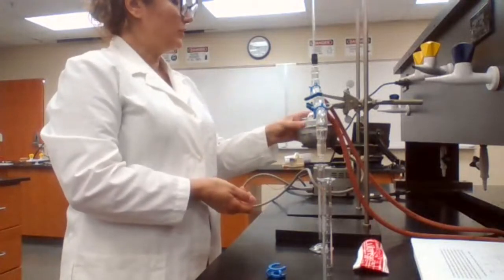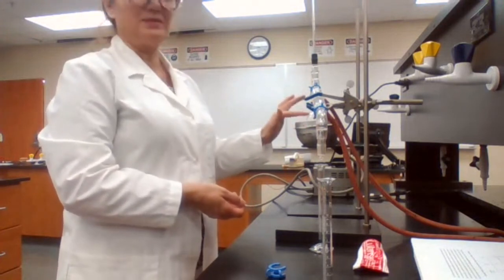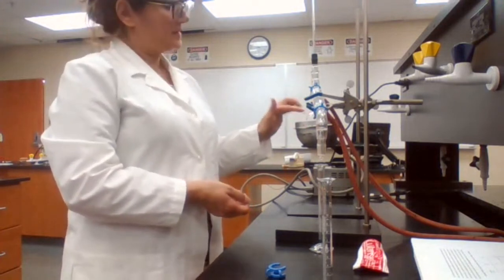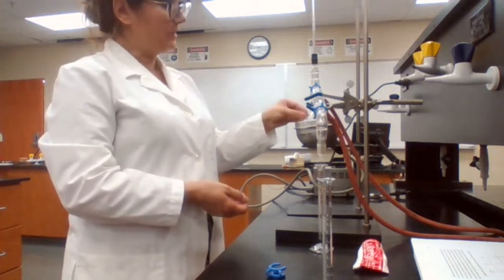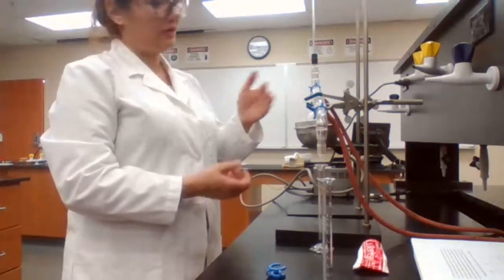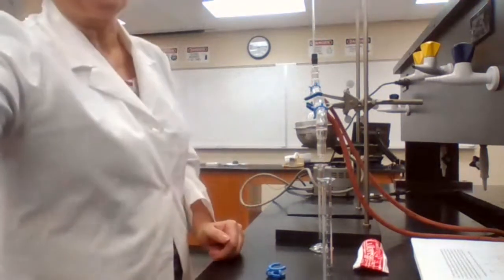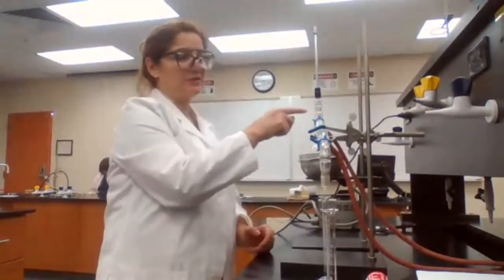One of the reasons for not heating up fast is that if you have vigorous boiling, especially if the flask is more than half full, the liquid can bump into the condenser. So if the liquid does not change to vapor, the liquid, which is a mixture of two, is going to be transferred to your graduated cylinder.